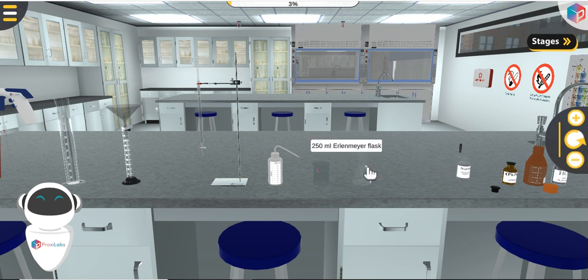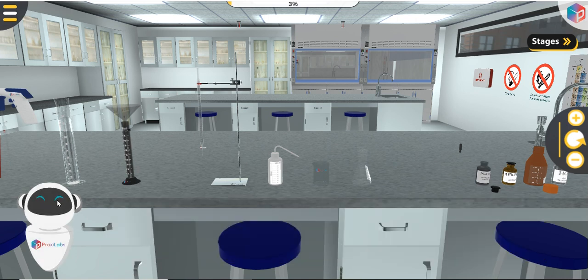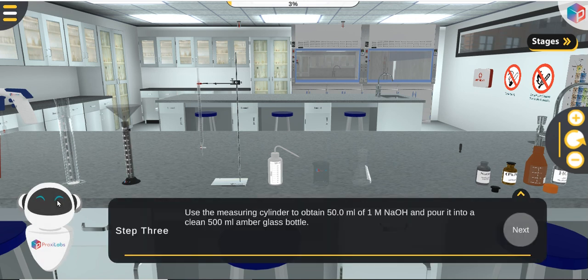How many ml again? I'll go back to my instruction. 50 ml. Okay. All right, I got it. Okay, I need my measuring cylinder.